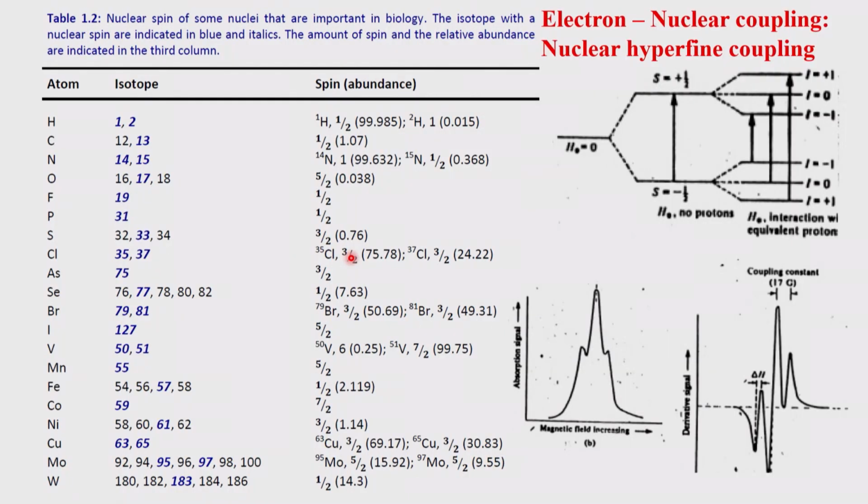I have already explained to you such kind of signature pattern, the isotopic distribution, when we talked about the mass spectrum. Similarly here, the hyperfine signature pattern is very unique for that particular thing, so nothing else will match. Now I hope you got the whole exercise. I took it one by one, but you need to spend a little time.